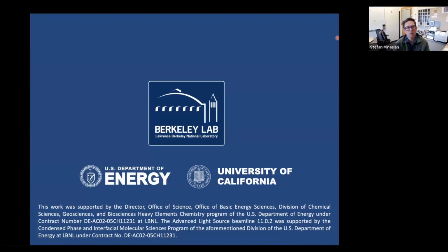Right. So the barrier to the air in this case is the silicon nitride, which is pretty robust for diffusion of oxygen, I would think. But then you have the epoxy around the edges, and so oxygen could presumably diffuse through the epoxy with time. In general, we find that these samples are able to be in air for at least a few minutes without degrading, but we don't take any chances.